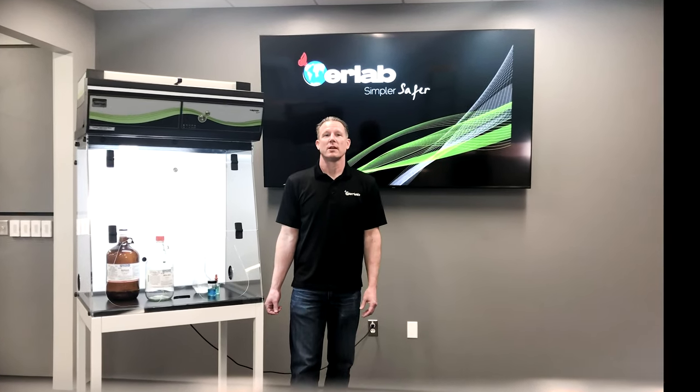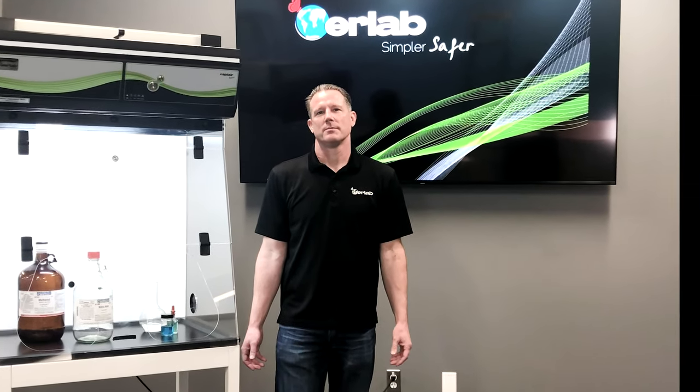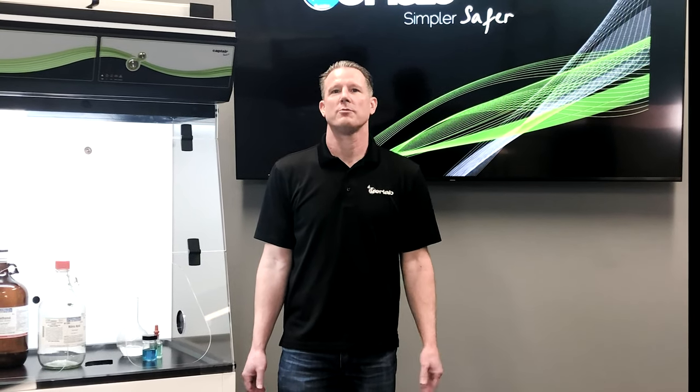I'm often asked how quickly one can set up an Erlab fume hood unit and make it fully operational. The answer is quite simple: in minutes. Hi, I'm James Goodwin, Operations Manager here at Erlab, and today I will demonstrate how quickly the Erlab fume hood can be made fully functional.